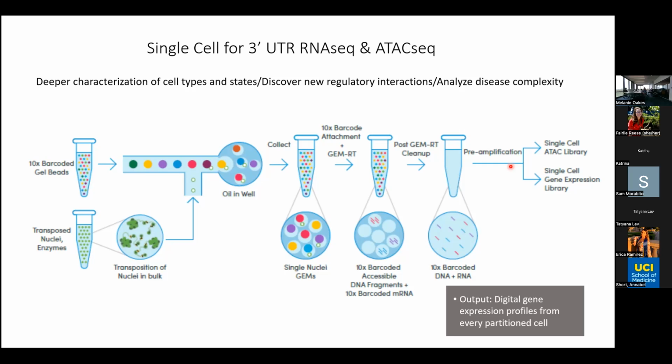Keep in mind with reverse transcriptase, this is why we keep asking that the cells be washed before they're brought to us, or the nuclei be washed. If there's leftover, for instance, EDTA in there, then our reverse transcriptase is not going to work. So we need it to be super clean because we're doing some enzymatic reactions.